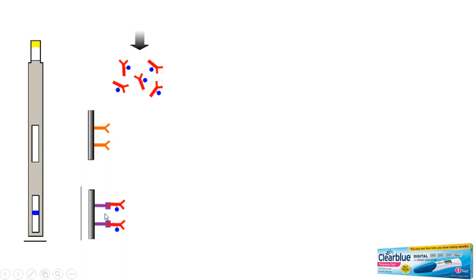Okay, and that's why you'll see one blue signal for non-pregnant, when there's no pregnancy, because you're getting the enzyme reaction here but not here. Now, what happens when you are pregnant?